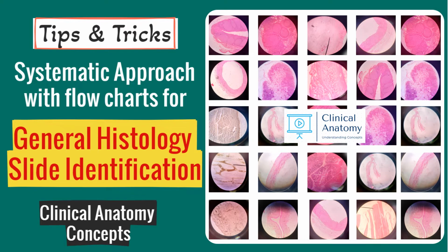Hello everyone. In this video, we are going to learn tips and tricks to identify the general histology slides. I have framed a systematic approach with the help of a flowchart to identify all the general histology slides.